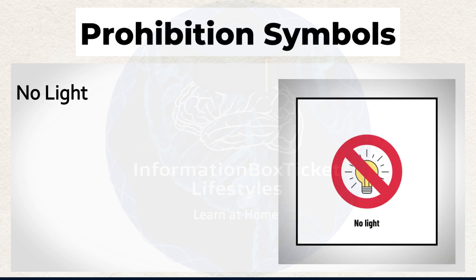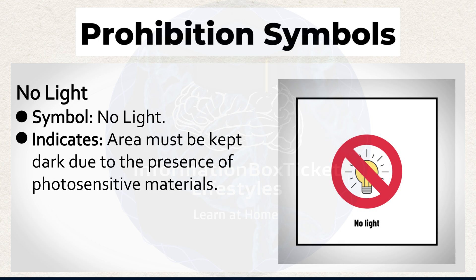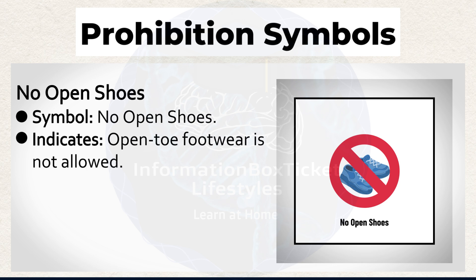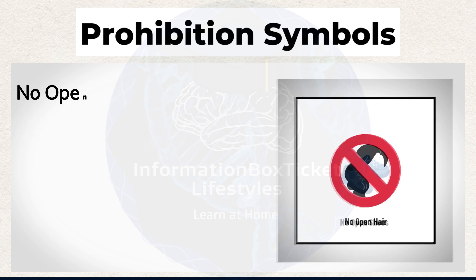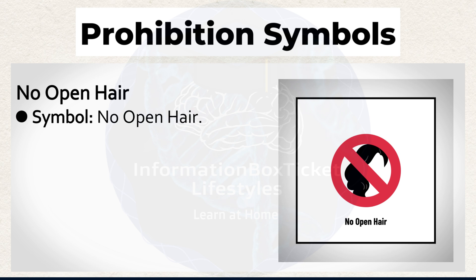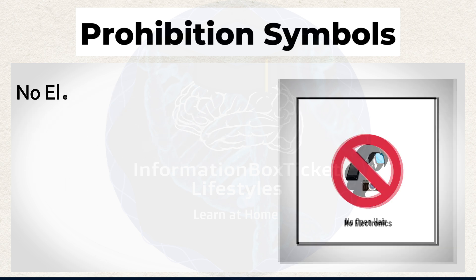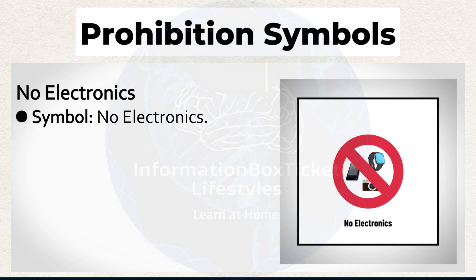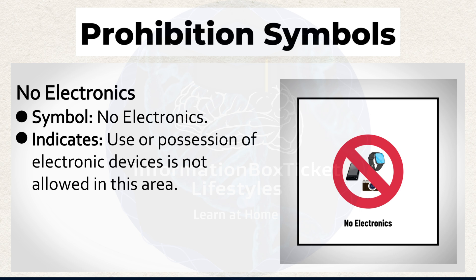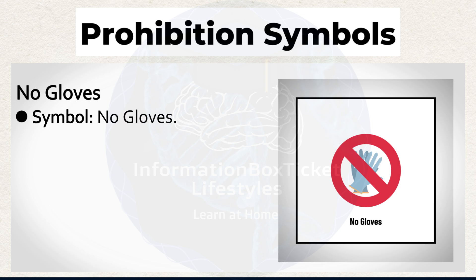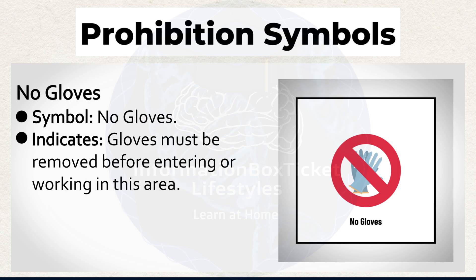No Light symbol indicates that the area must be kept dark due to the presence of photosensitive materials. No Open Shoes symbol indicates that open-toe footwear is not allowed. No Open Hair symbol indicates that hair must be tied up or covered — loose hair is not permitted. No Electronics symbol indicates that use or possession of electronic devices is not allowed in this area. No Gloves symbol indicates that gloves must be removed before entering or working in this area.